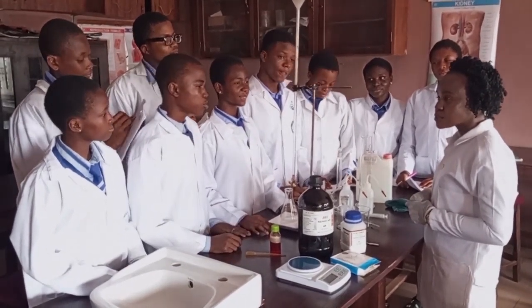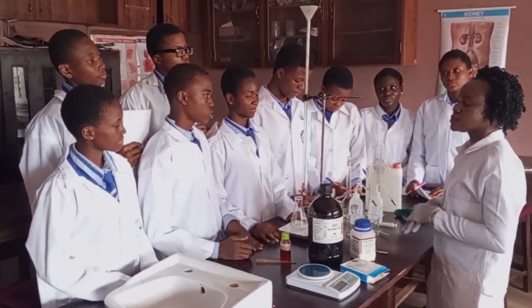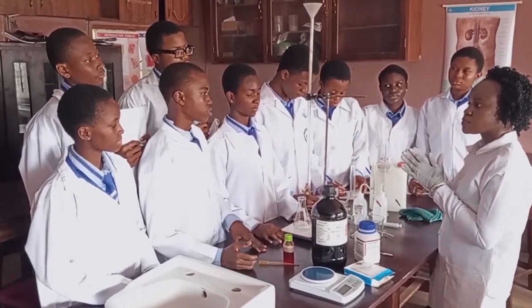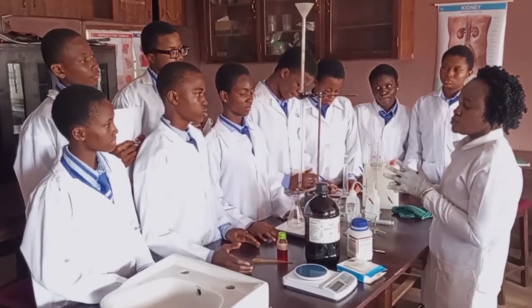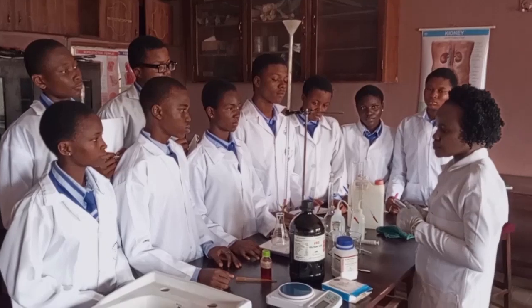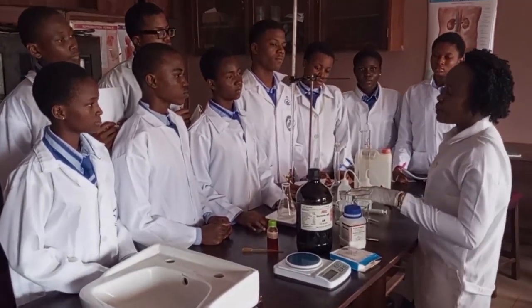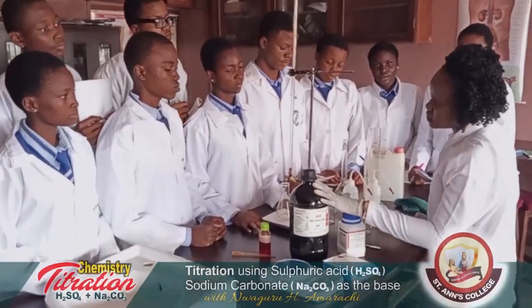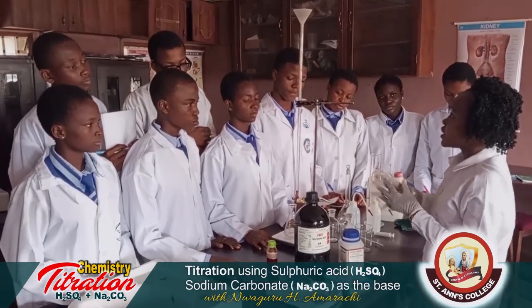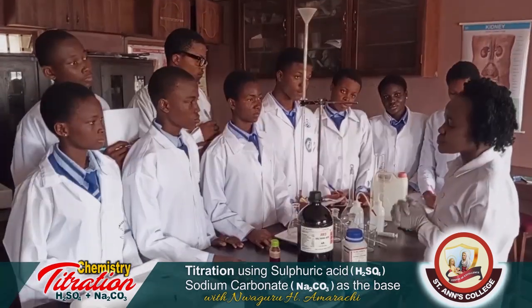A titration reaction is defined as a type of reaction between an acid and base to undergo a neutralization reaction using a suitable indicator in order to identify the concentration of the acid and base. Good. Now we have our acid and we have our base. So we are going to carry out this practical to see how a base will neutralize the acid, of which we have our indicator that will enable us to get the endpoint, which shows that neutralization has taken place.